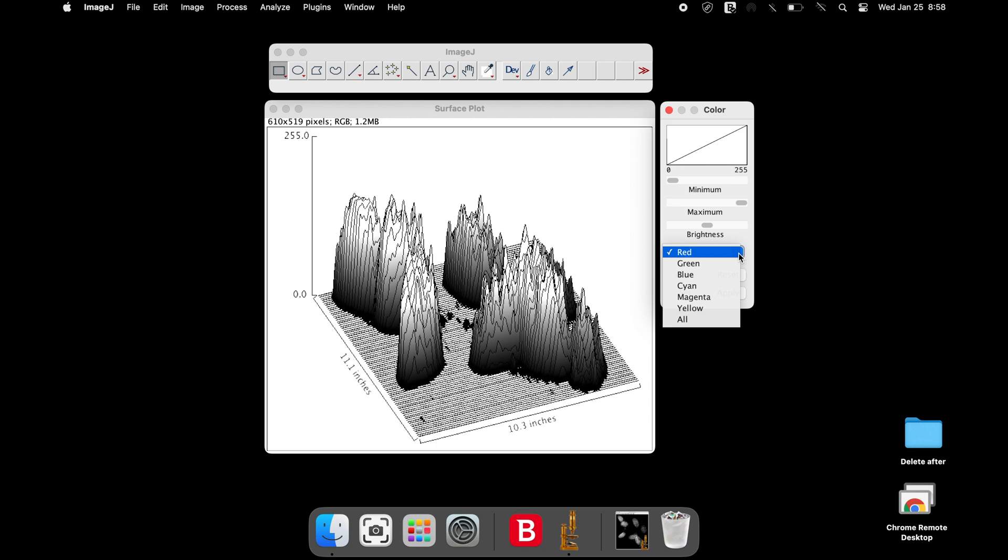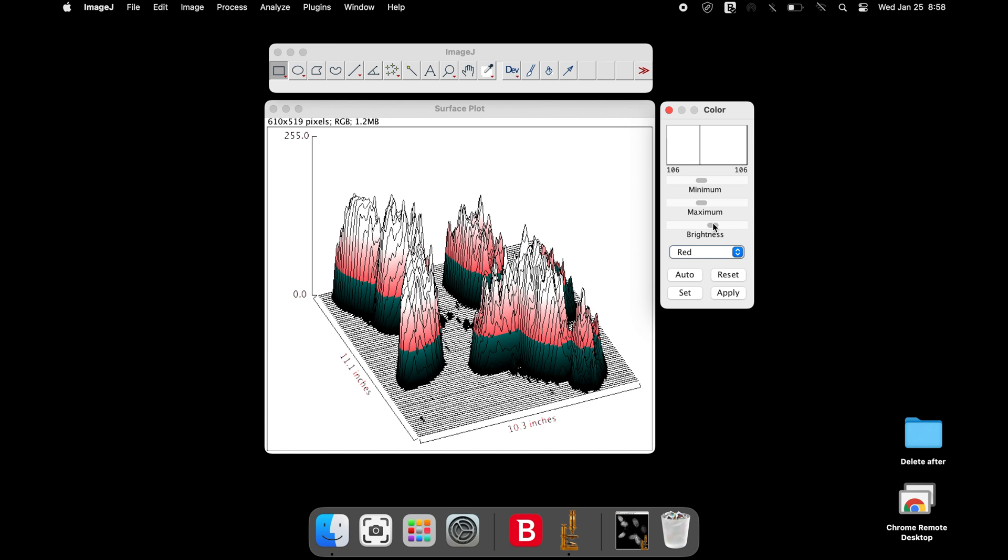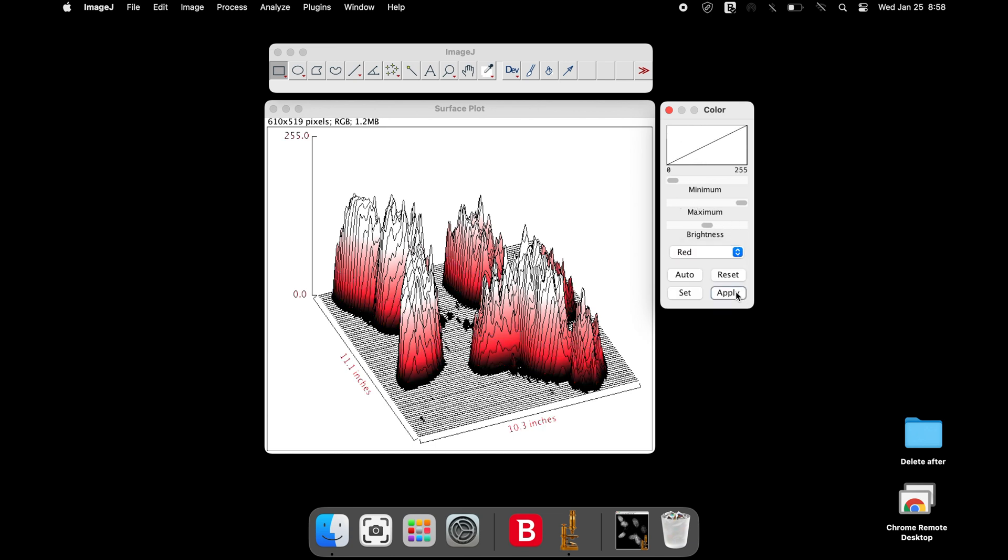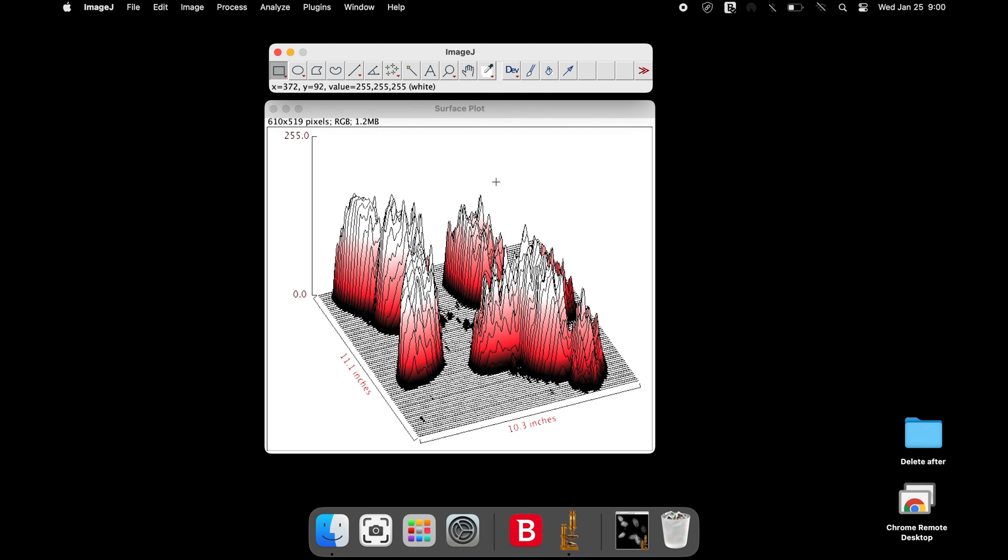Once the color balance is satisfactorily applied, click Apply. The color dialog box can be safely closed.